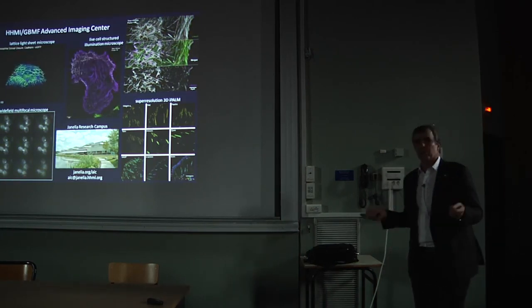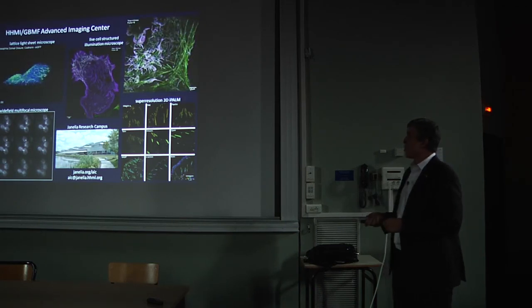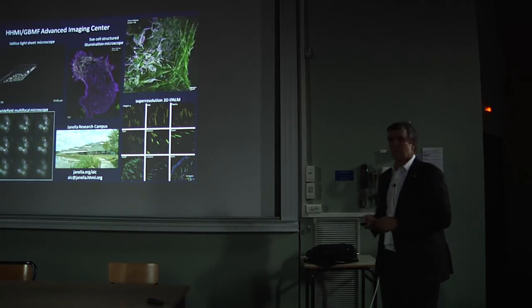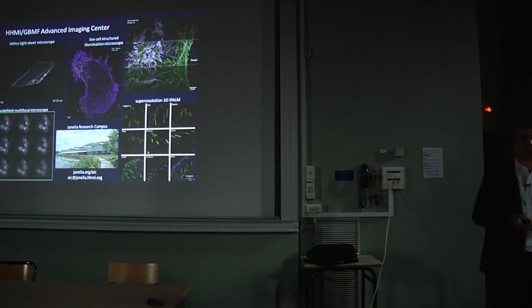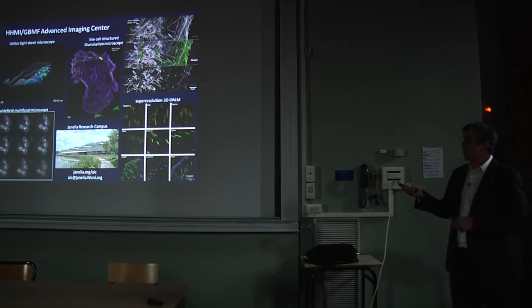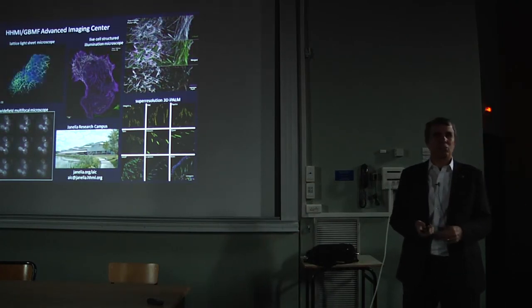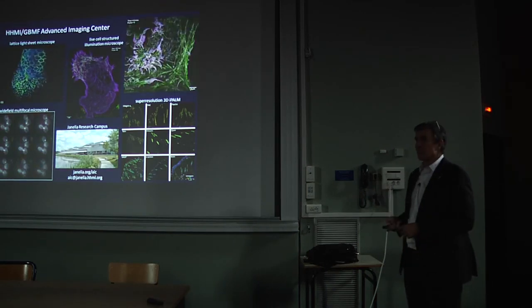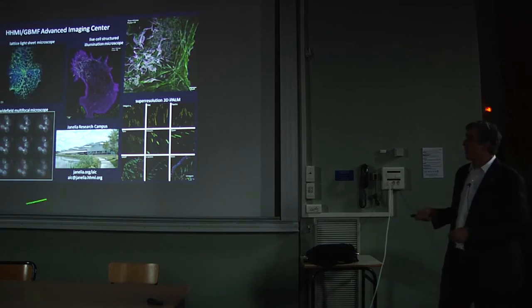And then finally, commercialization. So PALM has been commercialized for ages. While there are many commercial implementations of SIM, I don't think any of them are as good as what SIM should be. And so we're trying to make sure that people have access to being able to build the SIMs. And it's really quite cheap and fairly easy to build a SIM.